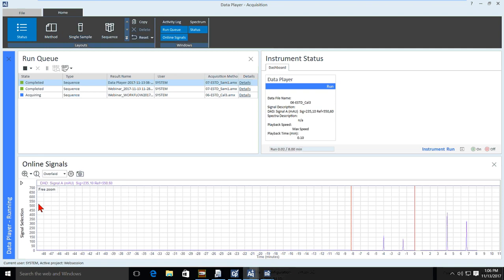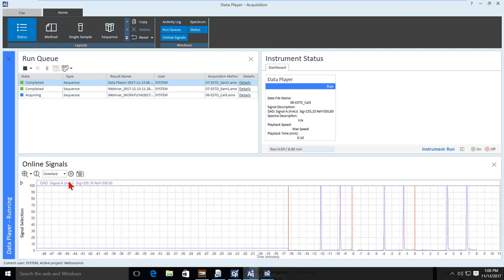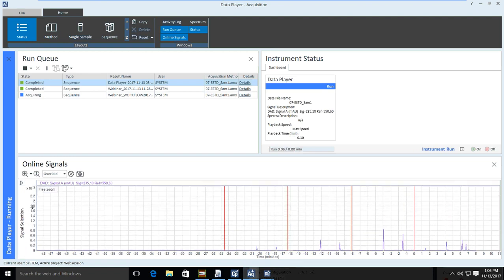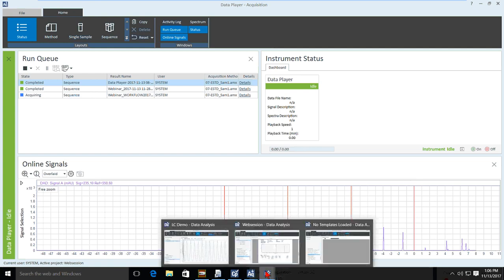And then my level 3 will come out here in a second. There's my level 3. And again, the online signals, it normalizes based on run. So that's kind of why it's acting a little goofy when I'm shrinking it, since these are such quick runs, it's actually normalizing right on the fly. So there's my 4th one. All right, so then we're good there.